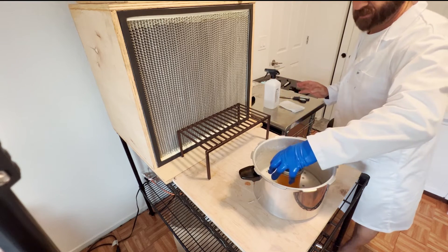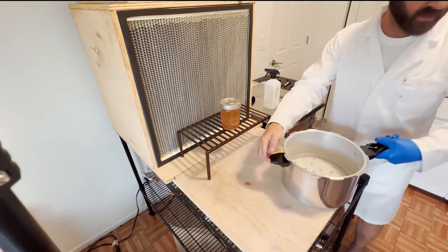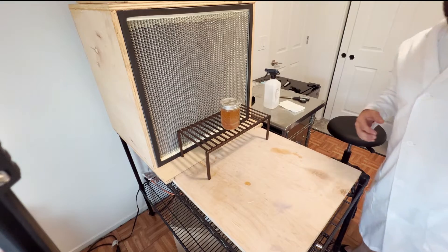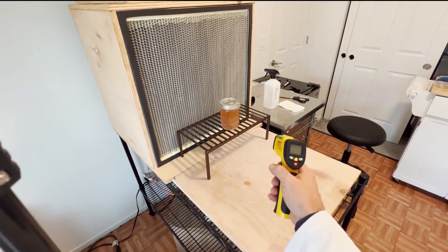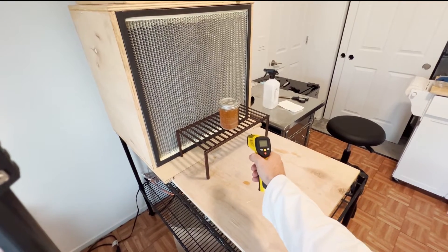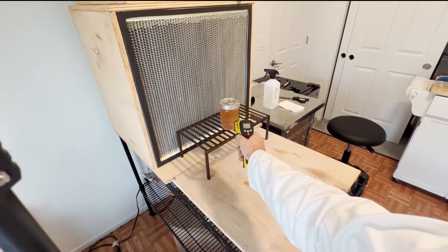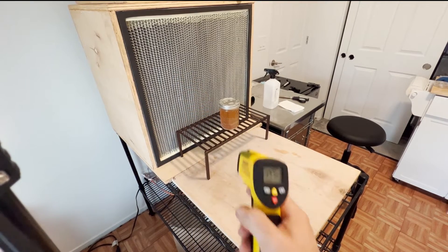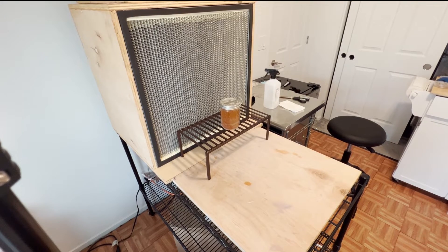Take this out, put it there, move the pan back. Now that we've got our agar out, we're going to check the temperature. When it gets down to around 120 that's when we want to pour — we're sitting at about 177 right now, so we'll let that keep coming down.